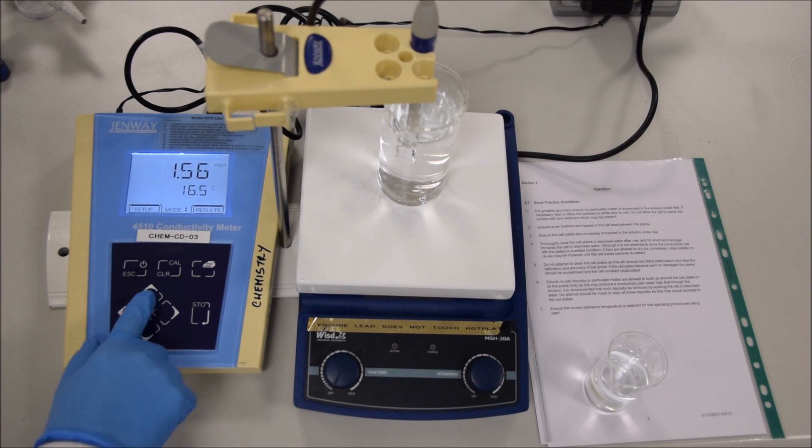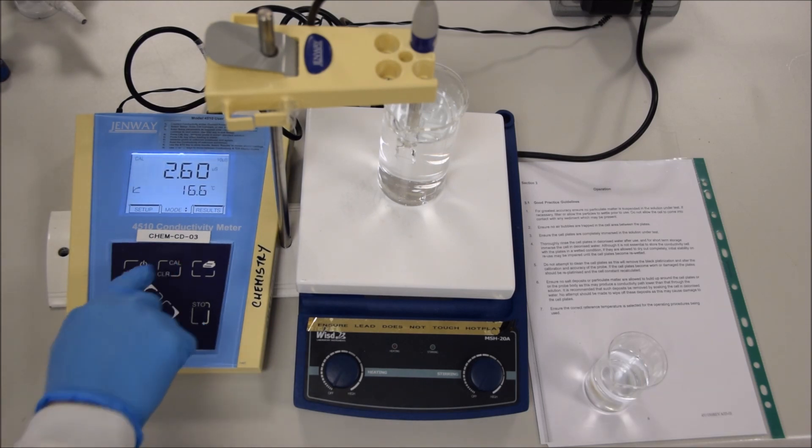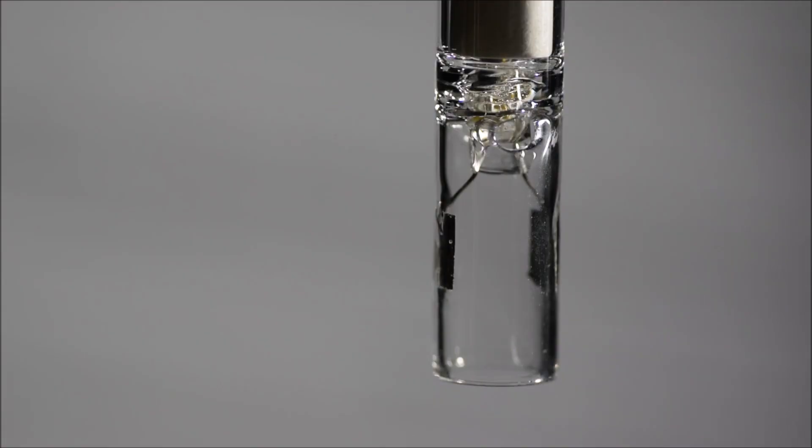The unit Siemens is named after the German industrialist from the 19th century. As you might imagine, it gets a capital S, unlike seconds, which gets a small s. The other thing to note is that it's usually going to be Siemens per centimetre.